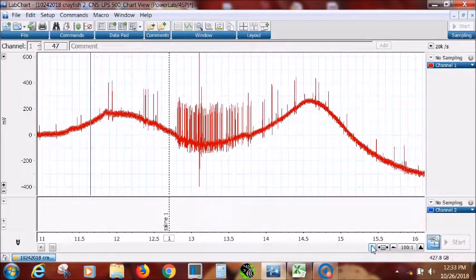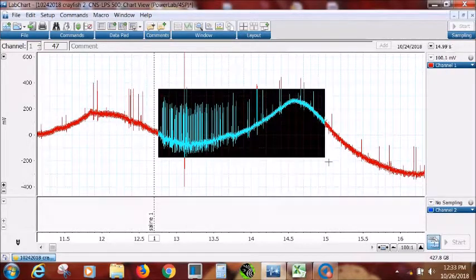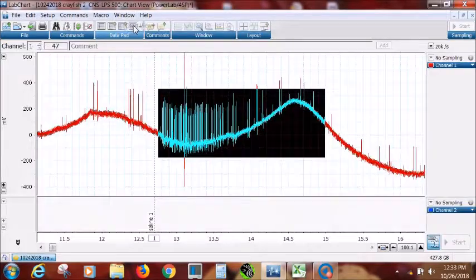All right, so now we have this one in the center and we want to count the frequency of these. Now you could zoom in for like 2 seconds and use the windows up there and actually try to manually count these, which would take a long time. But let's go ahead and see if we can do this with an automated approach.